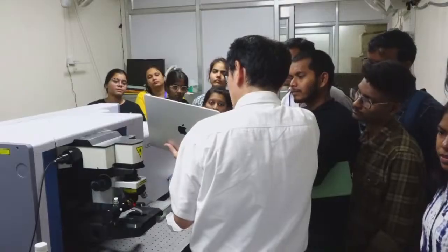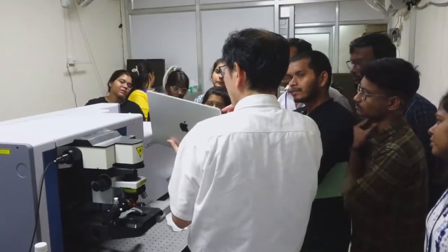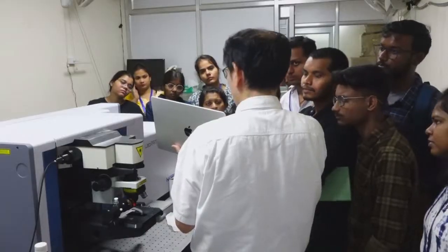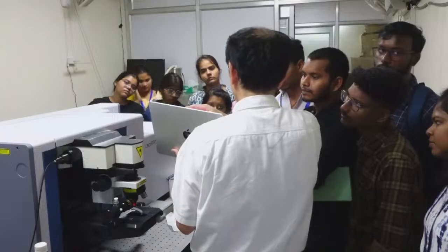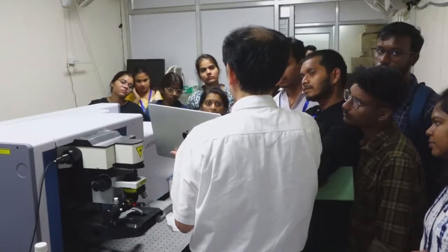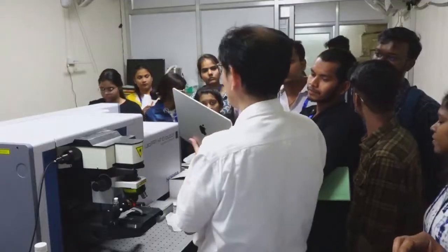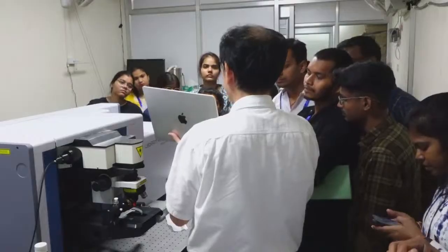Now the signal count is nearly 50 counts. So when we prepare a figure to publish a paper, we gather 1 million counts or so. This data is obtained in 24 seconds: 6-second exposure, 4 times accumulation, 24 seconds.